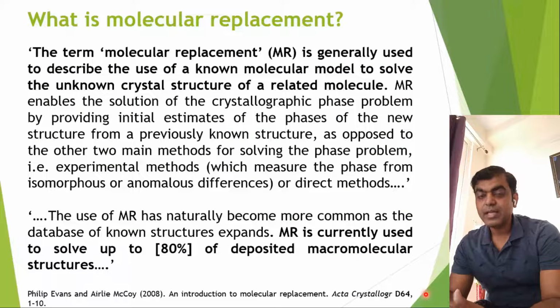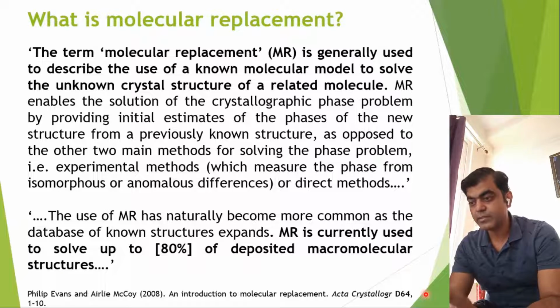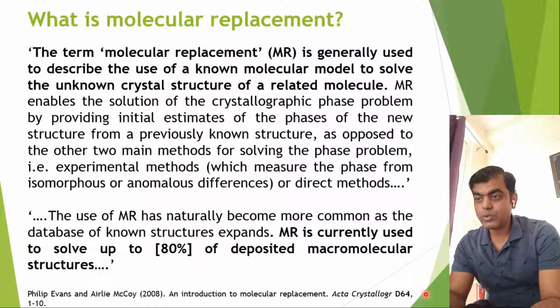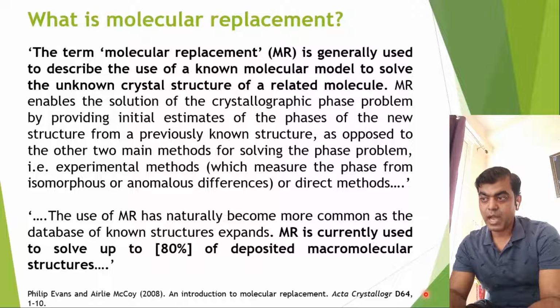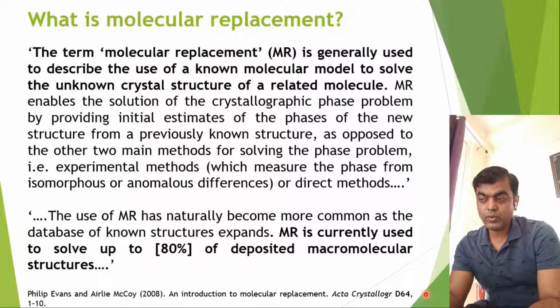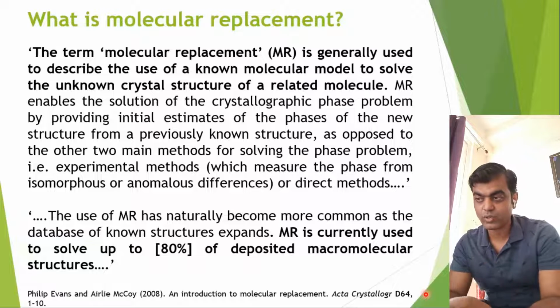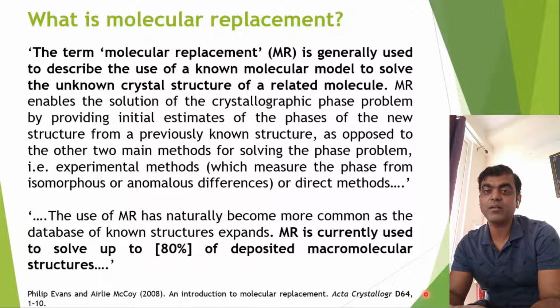Okay, now let's understand this molecular replacement in depth. If you go by this, it is basically used to describe the use of a known molecular model to solve the unknown crystal structure of a related molecule.